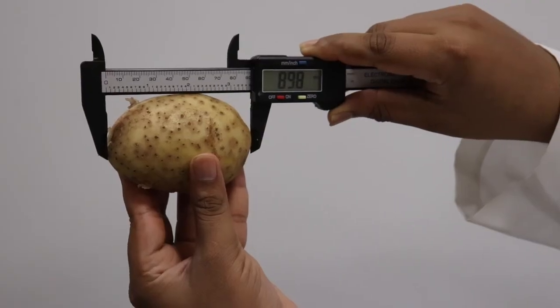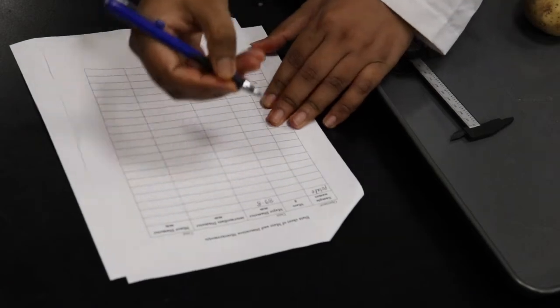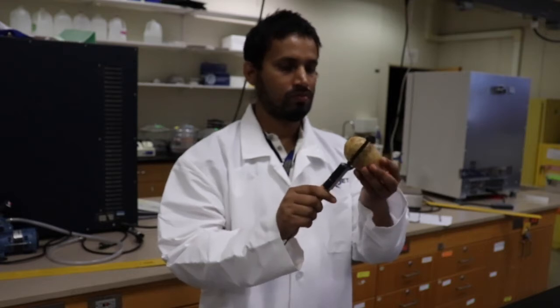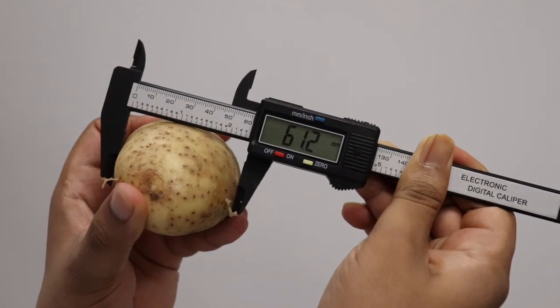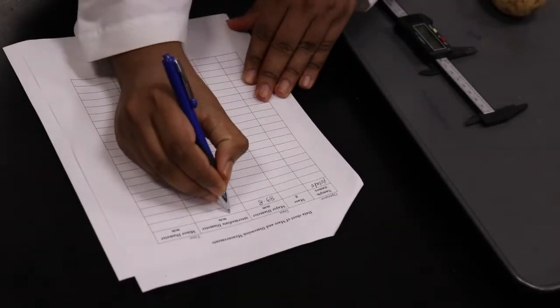Read the value of major diameter and then record it in the data sheet. Secondly, measure the intermediate diameter. Read the value of intermediate diameter and then record it in the data sheet.